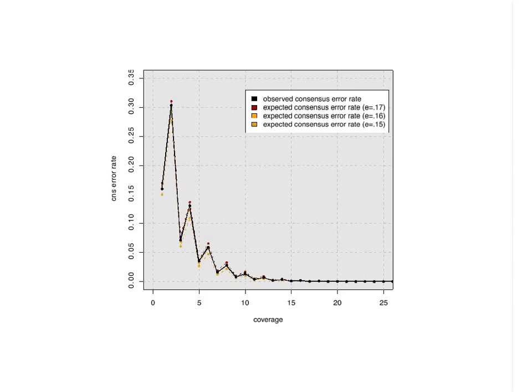Sergey, do you have any comments on single cell assembly while we're talking about it? Yes, I've been looking at some single cell assemblies from data generated by the Bigelow Laboratory in Maine. And one issue is that, at least in their hands, the PacBio required more DNA going in, so they had to do more amplification, so that did increase the bias in the PacBio data versus the Illumina data. So that's a matter of how much DNA you need to go into each instrument. If you need more DNA for one instrument than another, you may need to do another round of amplification, which will add more sequencing bias by that process.